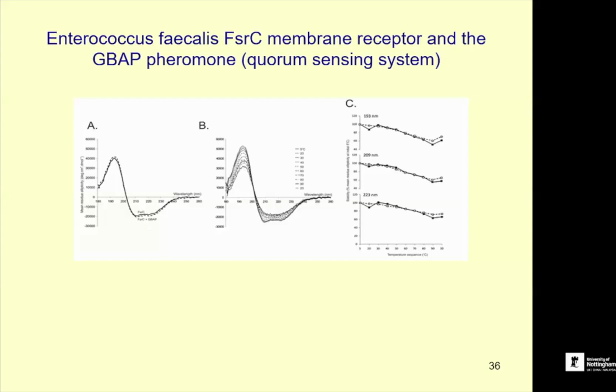So you need a synchrotron though, or can you use any CD instrument? Yes. For getting a quick result, you can use either. Benchtop's just as fast.